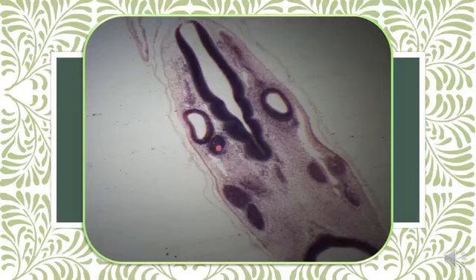Anterior to the ear vesicles, acousticofacialis ganglia. More anteriorly, trigeminal ganglia. Caudal to the ear vesicles, 9th and 10th cranial nerve.